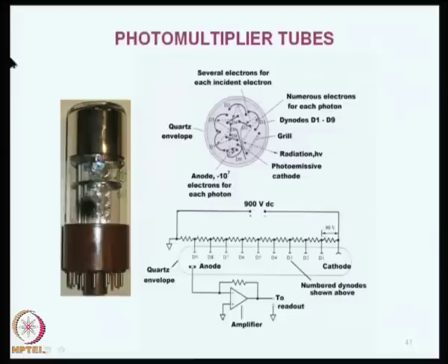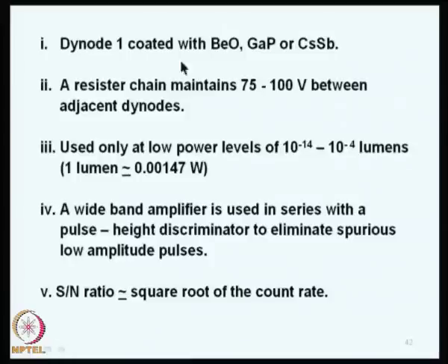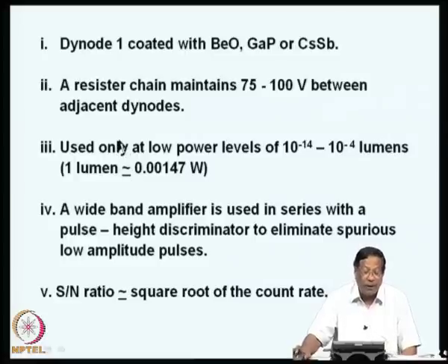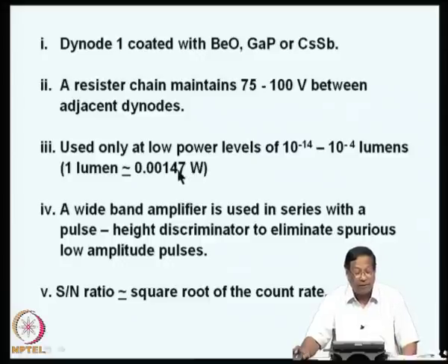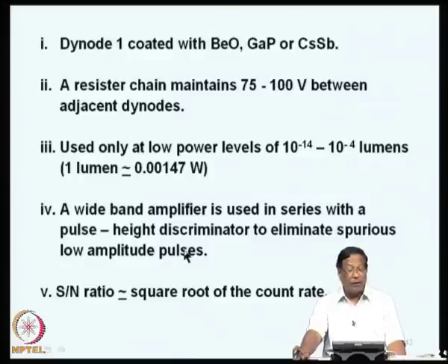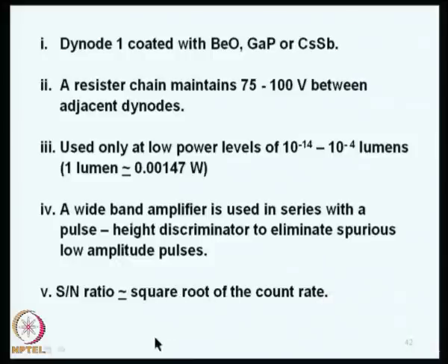So, these are used mostly for low wavelength regions, and a resistor chain maintains 75 to 100 volts between adjacent dynodes. That means each dynode is maintained at 75 to 100 volts higher potential. So, these are used only at lower power levels of 10 raised to minus 14 to 10 raised to minus 4 lumens. You will remember that 1 lumen corresponds to 0.00147 watts. So, a wide band amplifier is also required. It is to be used in series with a pulse height discriminator to eliminate spurious low amplitude pulses. The advantage is the signal to noise ratio, which corresponds to the square root of the count rate.